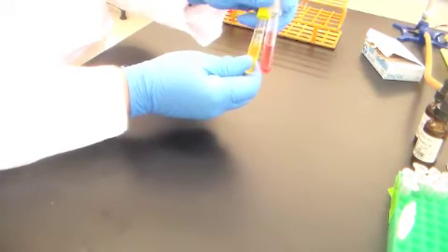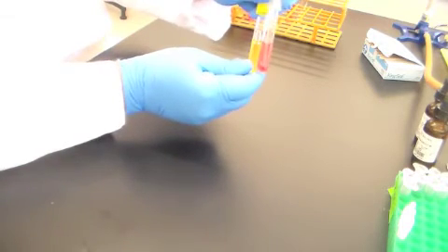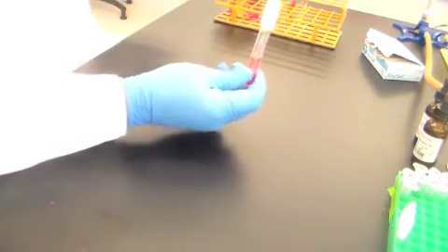A positive reaction when you've inoculated a broth for carbohydrate fermentation, so in this case lactose, this organism on the left would be a positive reaction for an organism that's capable of fermenting lactose, and it's also capable of fermenting lactose with the production of gas. A portion of the gas produced by this bacterium during fermentation of lactose was captured here, probably a mixture of hydrogen gas and CO2, almost certainly. So that would be a positive reaction.